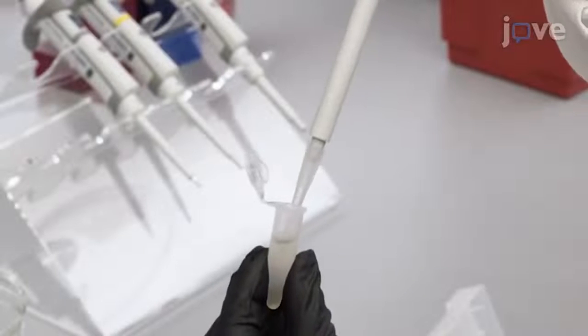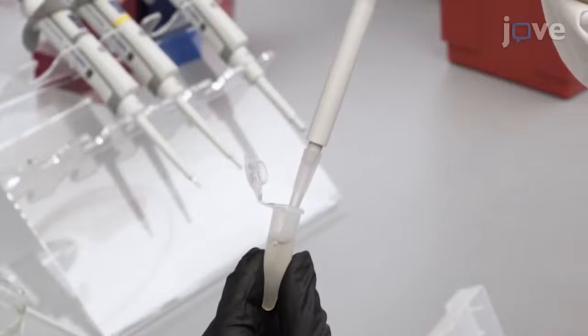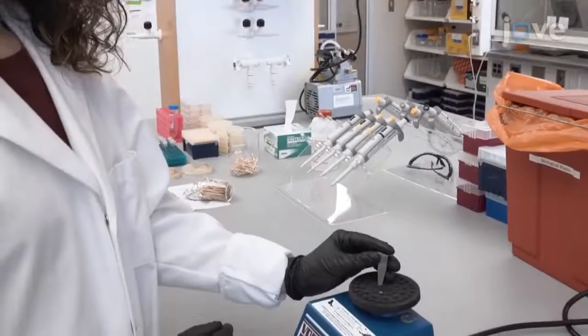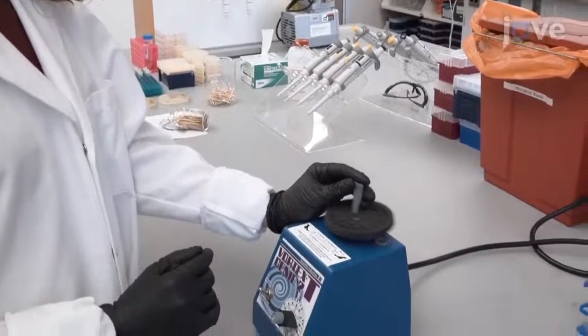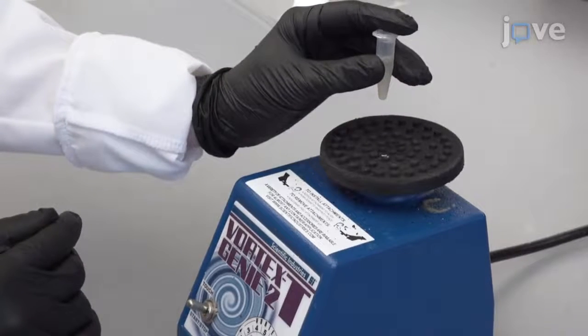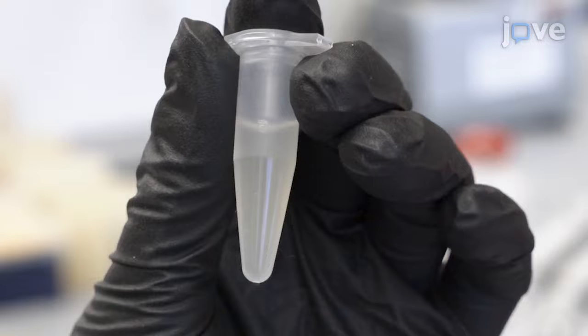To break up the cell clumps, press them into the side of the tube and then pipette up and down vigorously. Close the tube and vortex for 1 to 2 seconds, and repeat if the cell clumps are still visible, until the sample is visually uniform. Repeat these preparation steps from cell scraping till vortexing for all samples.